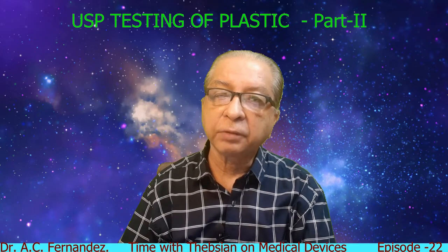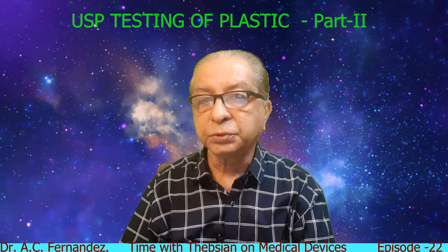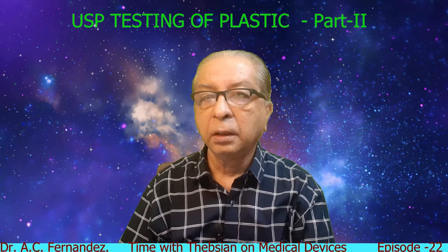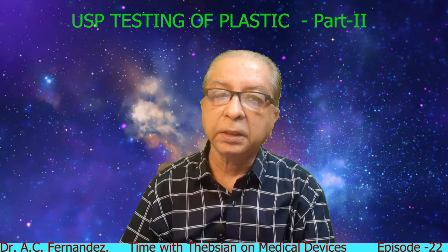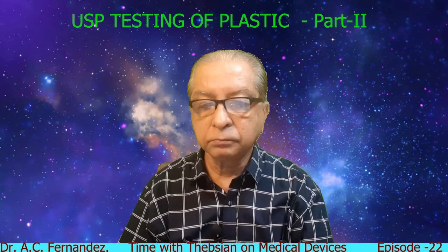The standard temperature of extraction is 70 degrees centigrade, and the toxicologist can choose the extraction temperature depending upon the need, for time for extraction and the details related to physicochemical properties of the test sample.